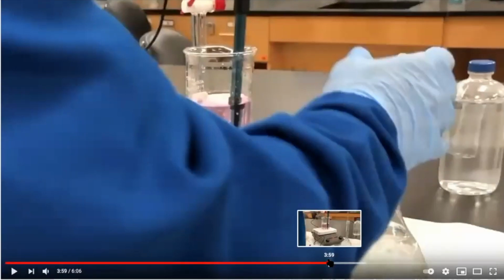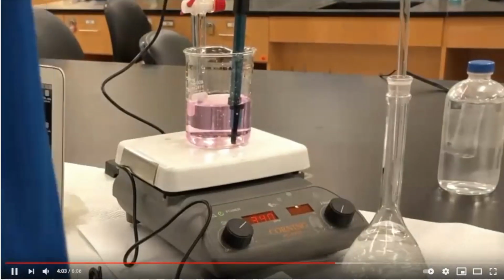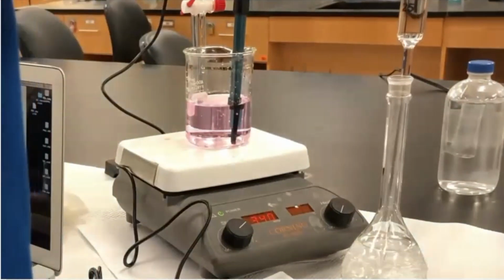Once we have this, take a look at this, because now that I have it at the endpoint, I'm taking a 25 mL volumetric pipette. I'm measuring it out, and then I'm adding it to this solution that is now at the equivalence point.